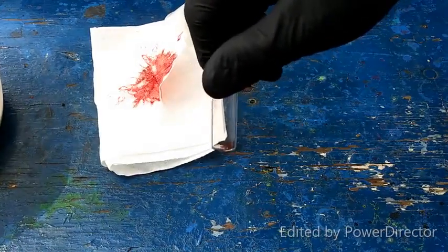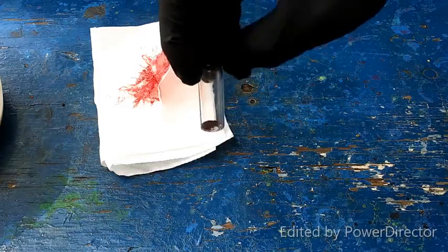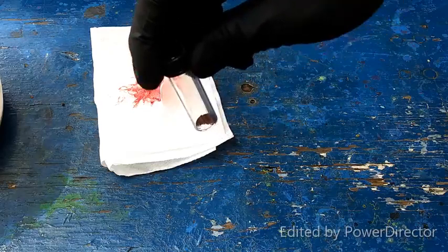So, I didn't use quite as much stuff to make this batch as I did the one we just did. So, I'm going to go put this under the scope and we're going to take a look at it.